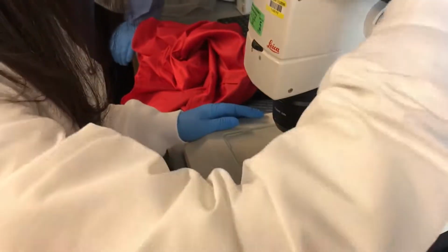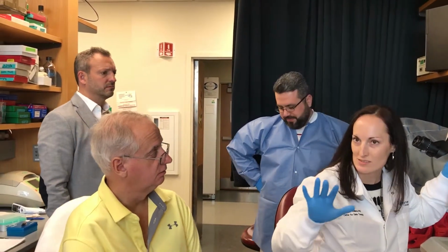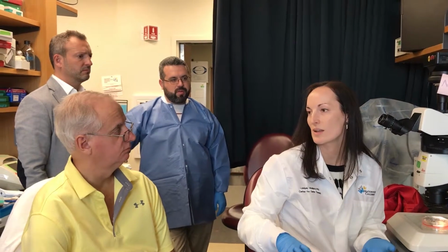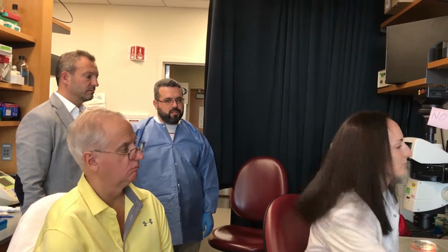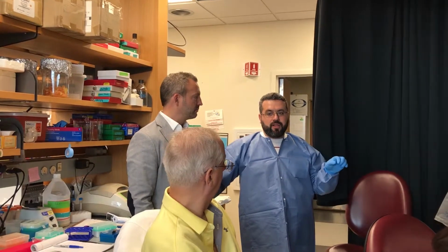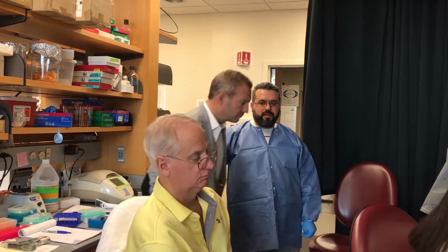Now, can you see DUX4 impacting the ability during cell differentiation? Is that in vitro? We can, but we have to basically freeze the cells. So we would have to stop them growing, fix them, essentially freeze them in the state that they're in, and then we could stain them, or we can look for DUX4 molecularly. We could lyse the cells and remove the protein and look at it that way, or look at the RNA through qPCR. So my project here is to differentiate them and reach the myotubes, and then I'll collect the cells, collect the RNA for the DUX4, and try to quantify or detect the DUX4 of these cells.